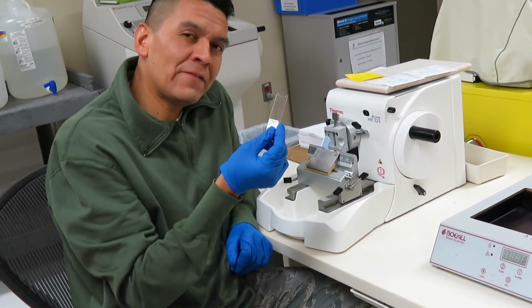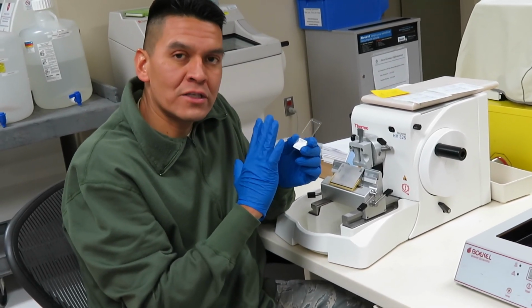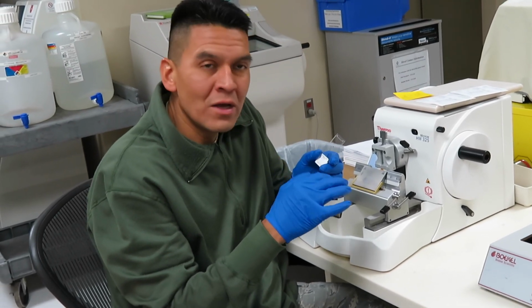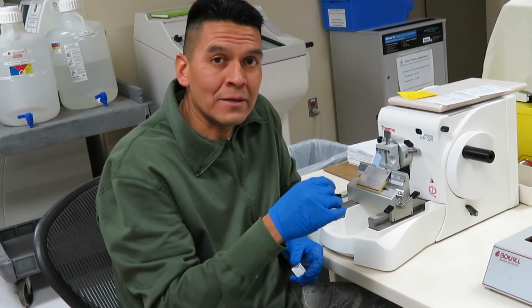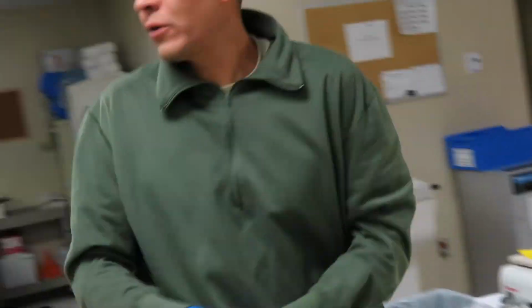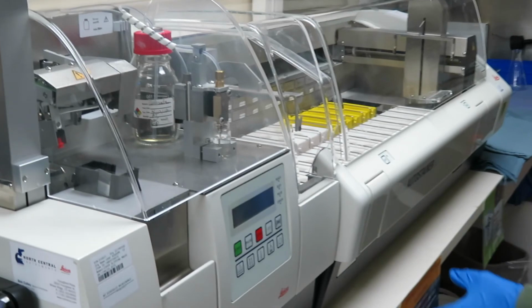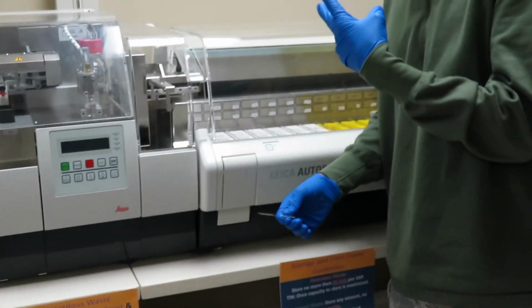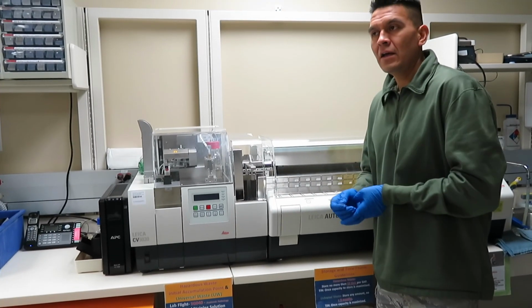Now, we're not quite finished at that point, because right now we do have a tissue on the slide, but it's just clear. You wouldn't be able to see anything under the microscope. So what we need to do in order to see all the different cellular structures is stain it up. And how we stain it up is we bring it over here to the fancy name of a stainer. And so this stainer, the two primary components are the hematoxylin and the eosin.